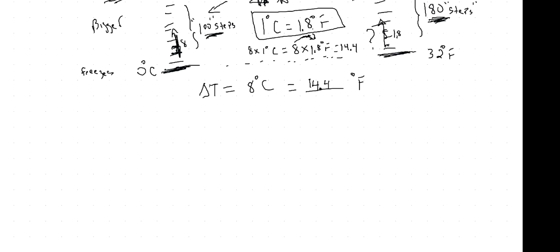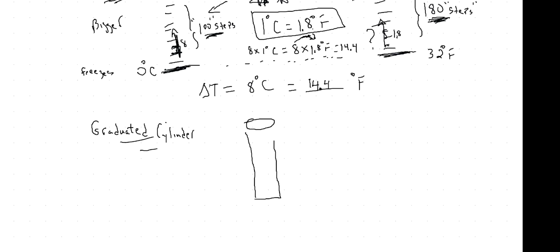Okay, let's talk about a graduated cylinder. This is also in the lab write-up. A graduated cylinder has markings, so we can measure volume. I'll draw a terrible picture here, and there'll be markings. That's the graduated part. Now let's do an exaggeration for one second.